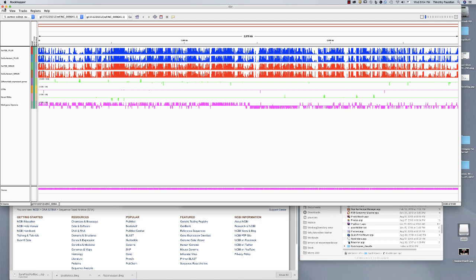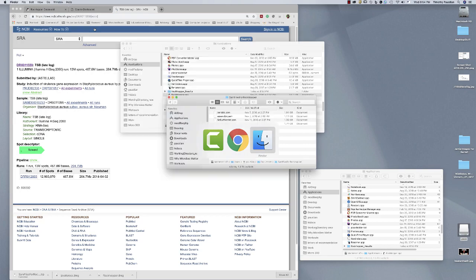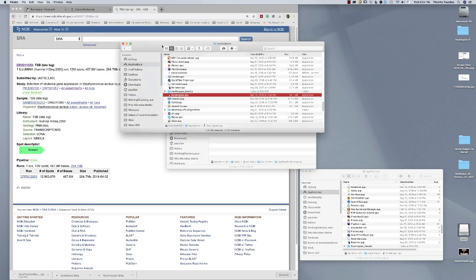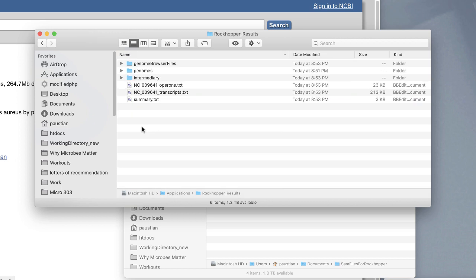Let's close down the Integrated Genome Viewer. What we're interested in is what RockHopper made. RockHopper will open a file called RockHopper results — it creates a folder and then creates files inside that RockHopper results folder. They will be in the same folder as your RockHopper app. Here are my RockHopper results. If I open that up, it shows you all of the files and what you're really looking for are these things right here.